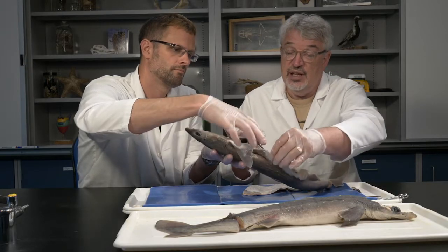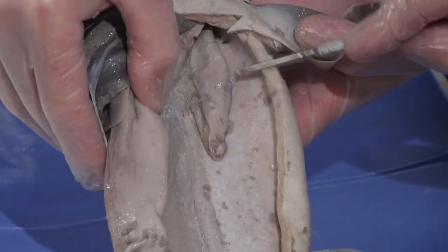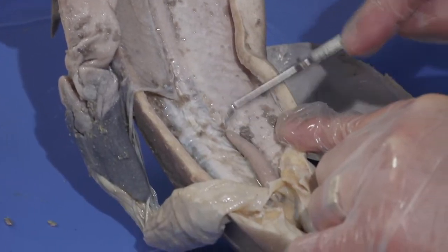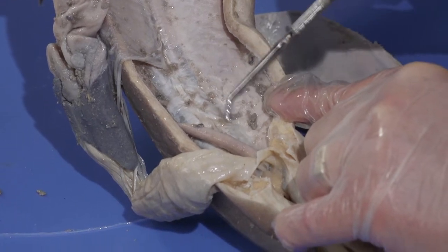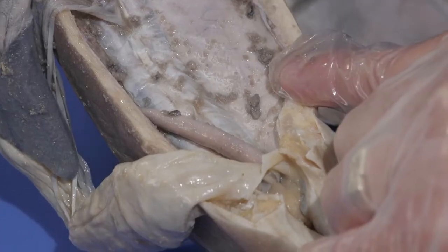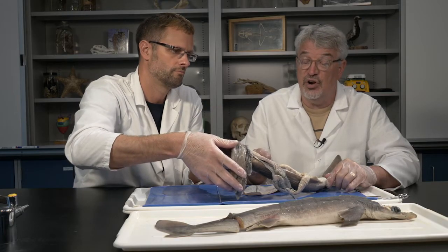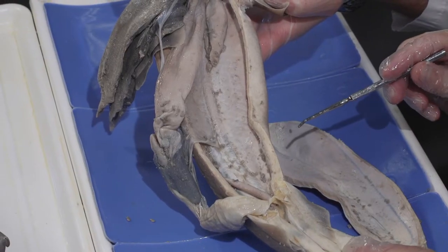Flipping that over, there are testes on the other side and again the sperm duct runs down the kidney surface. These are the beginning of what will be the seminal vesicles, which store sperm before it's transferred. Those are the major differences between a male and female shark — certainly in terms of internal anatomy, the differences are primarily in the urogenital system.